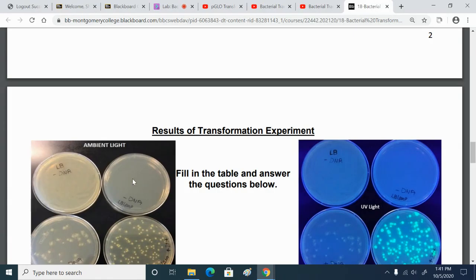Our E. coli cannot already be resistant to ampicillin, because resistance to ampicillin is how we know transformation occurred. We're giving the bacteria resistance. If they're already resistant, then we're not doing anything, right? So we have to prove that E. coli are not already resistant to ampicillin. And so there's no growth here, so that's what that plate tells us. No growth, no resistance.